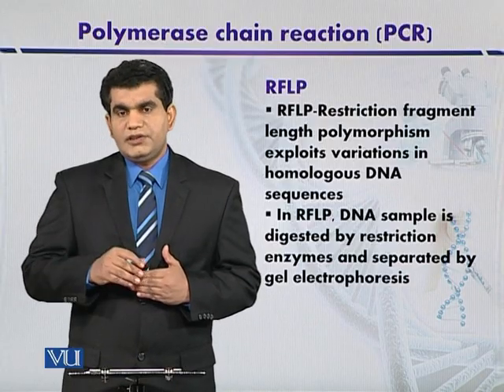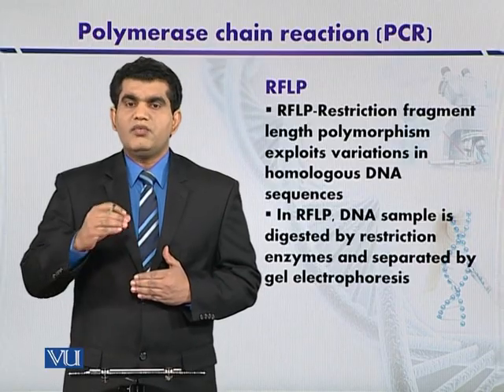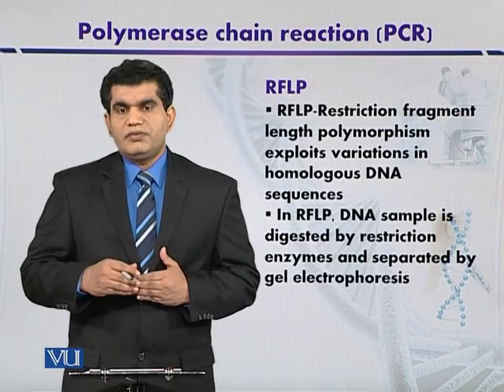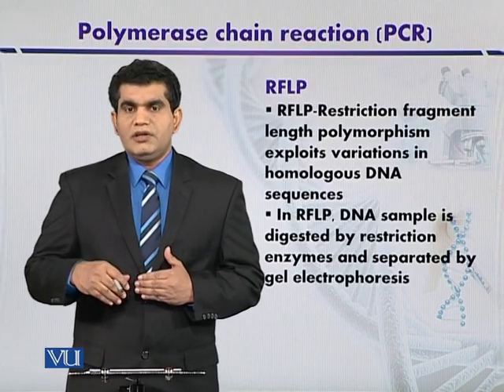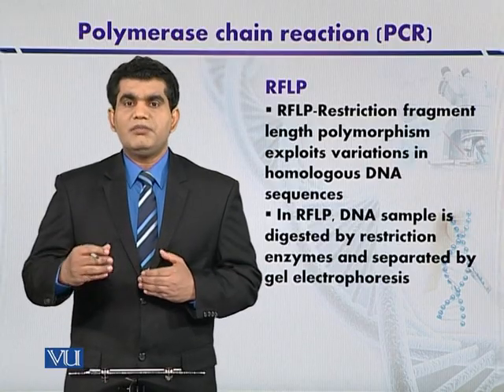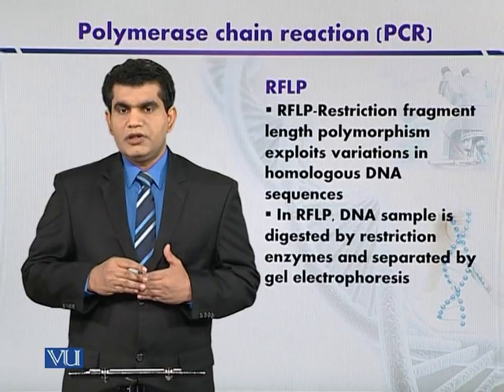And such differences within a genomic DNA we can study by using the RFLP technique, that is restriction fragment length polymorphism. Why is the name restriction applied? Now we are going to discuss.